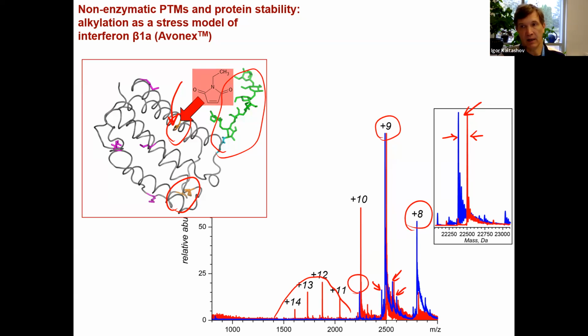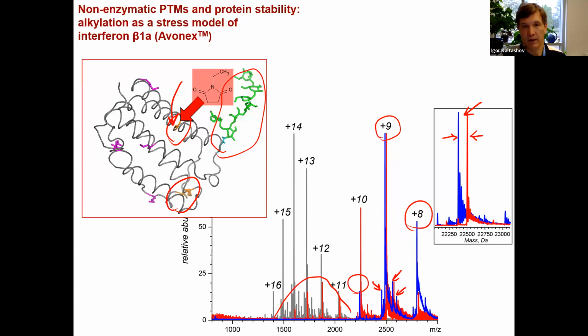So clearly, even a very simple experiment that takes literally a few minutes to complete would tell you that it's not a very good idea to use the cysteine as a pegylation site, and probably save the company a lot of money. Okay, and just for reference, this is a fully denatured protein.